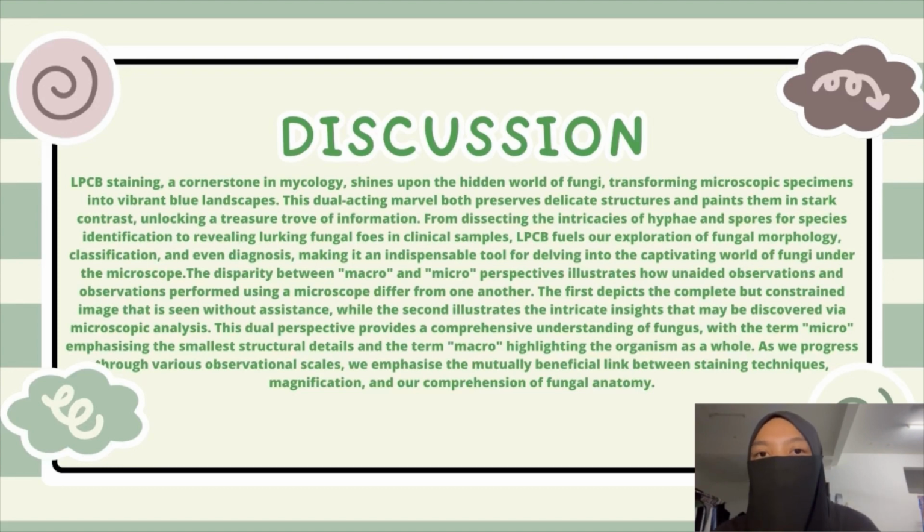LPCB fuels our exploration of fungal morphology, classification, and even diagnosis, making it an indispensable tool for delving into the captivating world of fungi under the microscope.